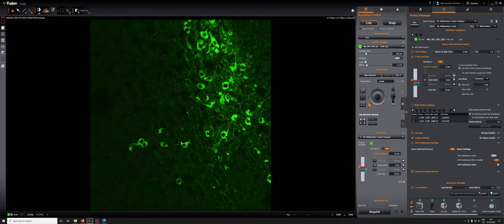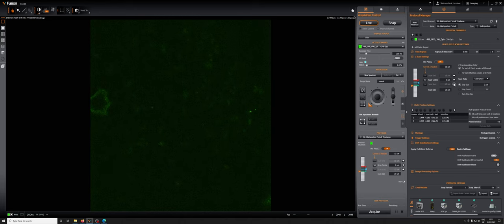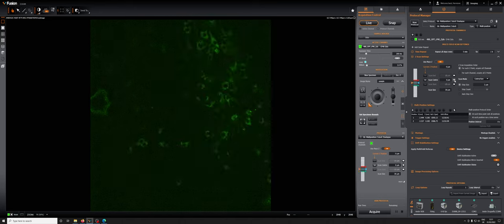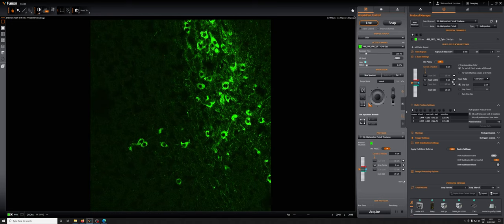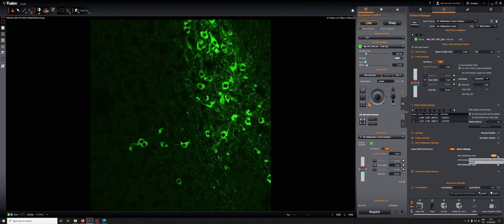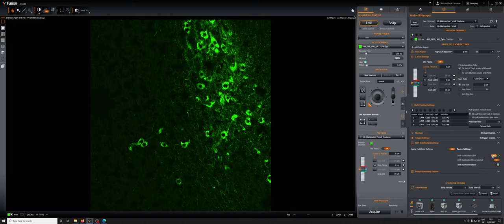We can check the position, the middle, whether we like it. If we do, we make sure we go back to the middle. We send the piezo to the middle of the imaging stack. We turn drift stabilization on, we add the point, and we click drift stabilization off.